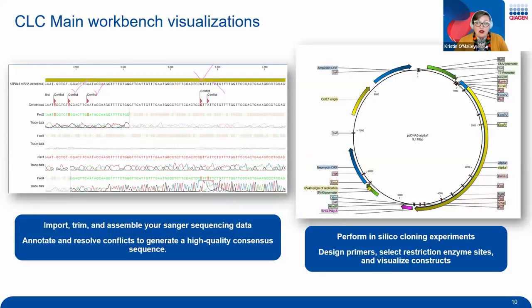So I'll show you how to resolve these conflicts and how to make sure that your consensus sequence is of the utmost quality that it could possibly be. And then lastly, we'll be generating some visualizations using the molecular biology tools.